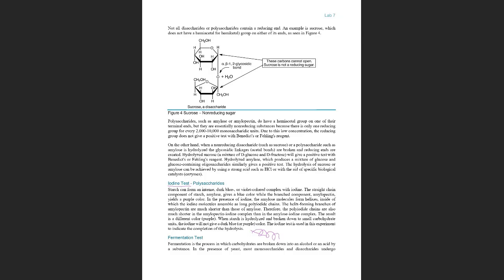The amylopectin is like 80%, is also a linear chain, but it's a branched molecule that is made of thousands of glucose units. Very good. So the second test we said is the iodine test, just to test starch.